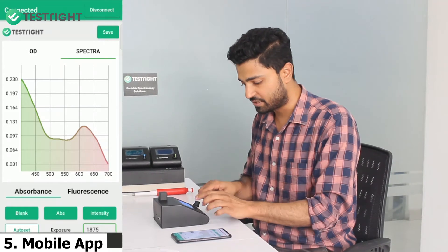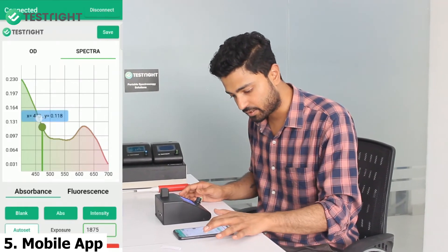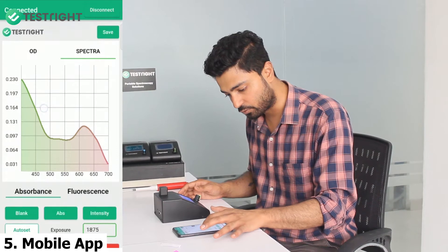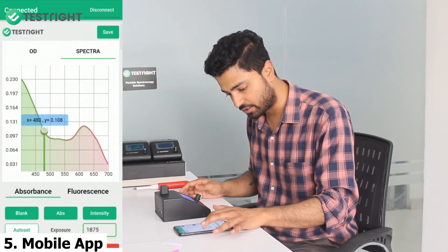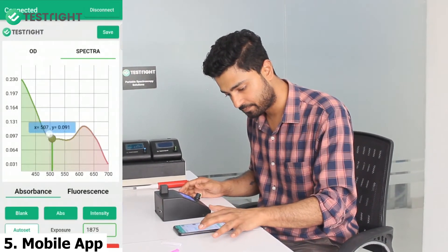Both the screens are showing the same spectra, and you can click anywhere on the graph to know its x and y values, just like this.